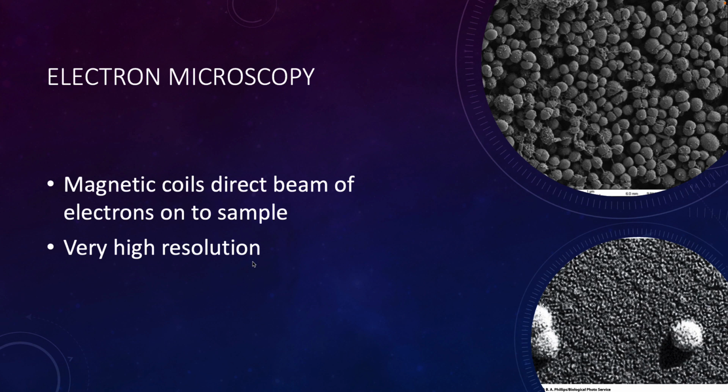And so as you see in this top image, this is Staphylococcus. This is actually a biofilm of Staphylococcus aureus that I grew. I didn't do the imaging, but I did grow it up. And so you can see the details of some of the connective structures that they have with one another, components of the biofilm. You can see some that are in the process of dividing. And then this is a transmission electron micrograph where you can see even more detail of the surfaces.